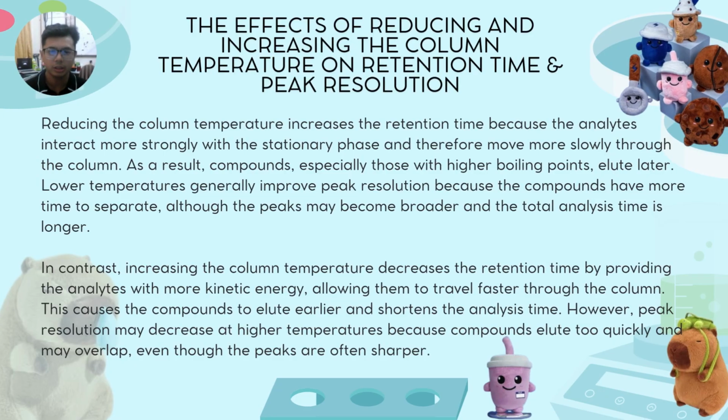Lastly, the effect of reducing and increasing the column temperature on retention time and peak resolution. Reducing the column temperature increases the retention time because the analytes interact more strongly with the stationary phase and therefore move more slowly through the column. As a result, compounds, especially those with higher boiling points, elute later. Lower temperature generally improves peak resolution because the compounds have more time to separate, although the peaks may become broader and the total analysis time is longer.